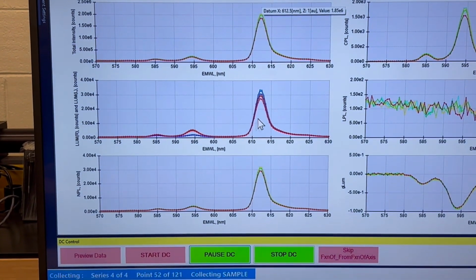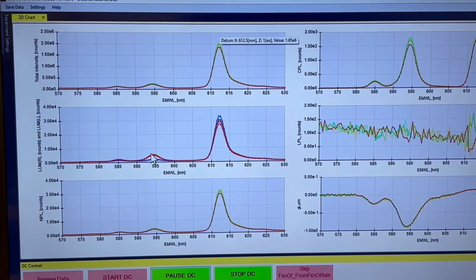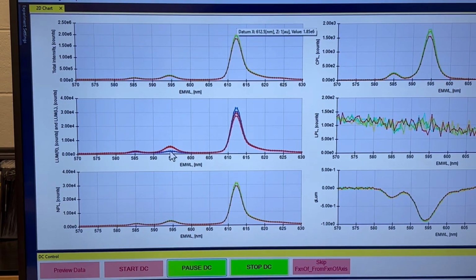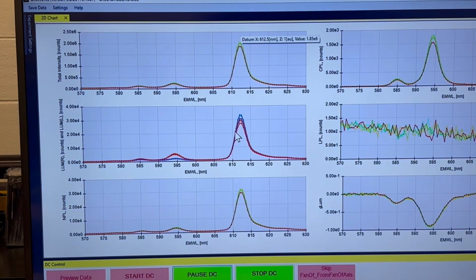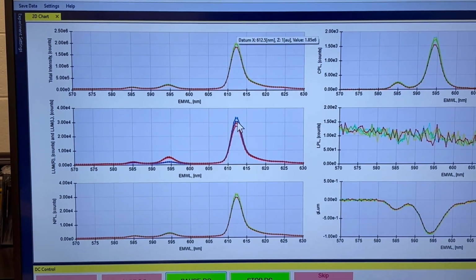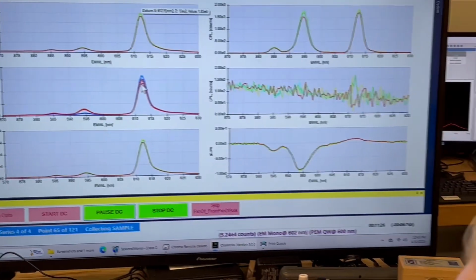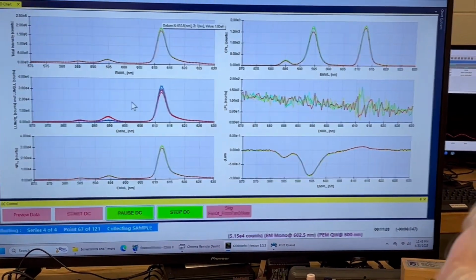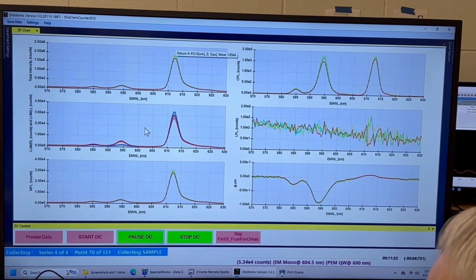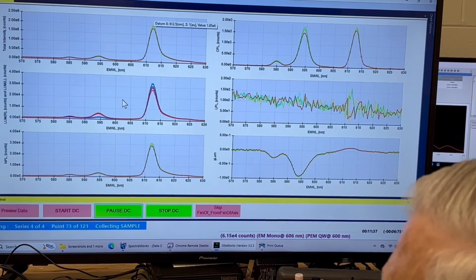However, finally, it's interesting, not too surprising to me given what I've seen, that changes in the peak here aren't as dramatic, whereas here, the big tall peak, the presence of water has made quite a dramatic change. And one can do these as a function of time. We'll prepare a fresh solution.